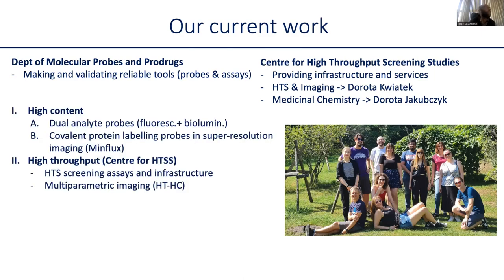So in terms of the topic and the types of tools I would like to talk about today, it is the tools for enabling high content or multi-dimensional, multi-parametric imaging. And in particular, I'd like to talk about so-called dual-sensing probes, and also probes which allow us to image multiple biochemical parameters with unprecedented resolution of a couple of nanometers.